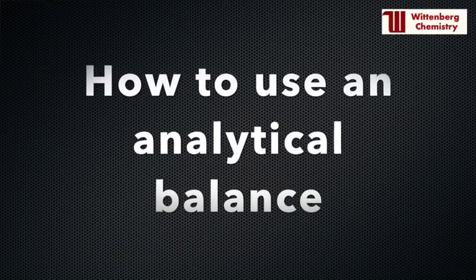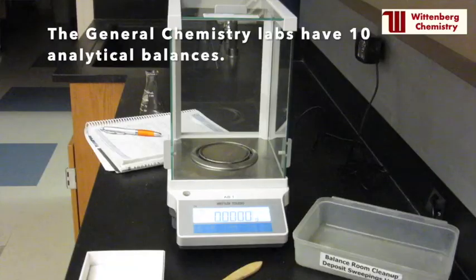This video will show you how to use an analytical balance. There are 10 analytical balances in the General Chemistry Laboratory at Wittenberg University.